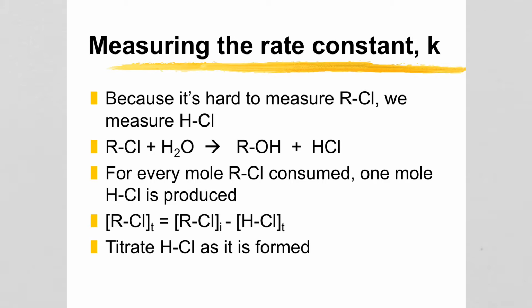Well, remember that HCl is a product of this reaction. And for every 1 mole of alkyl halide that is consumed or reacted, 1 mole of HCl is produced.